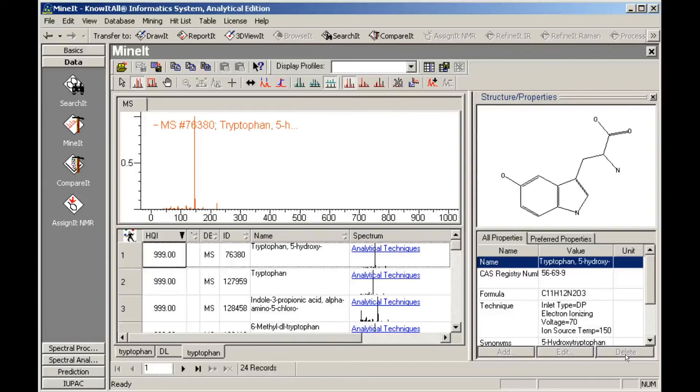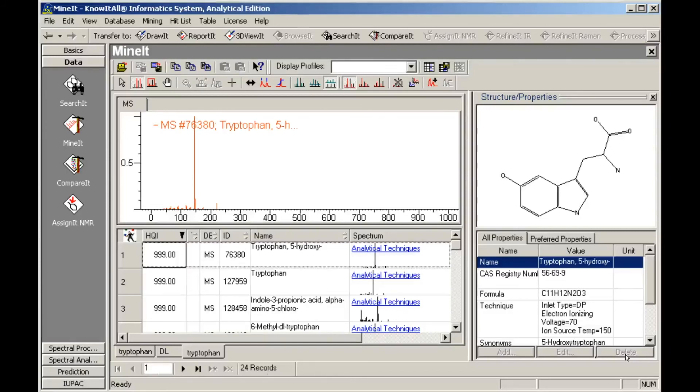As expected, the substructure search produces more hits than the exact match search. Note that the original hit list and the IR database are still displayed. We can scroll through the records in the new hit list.